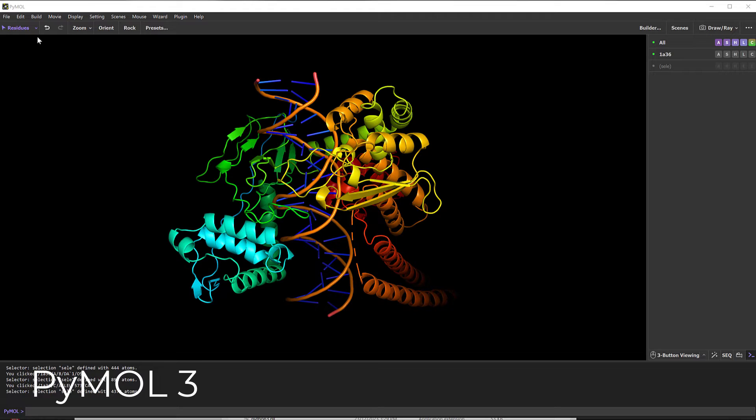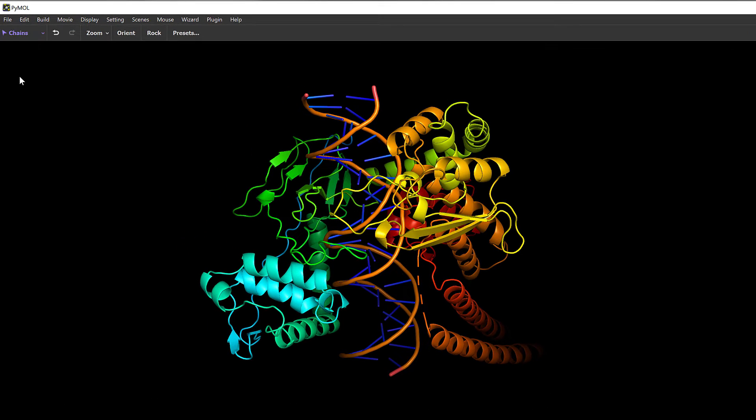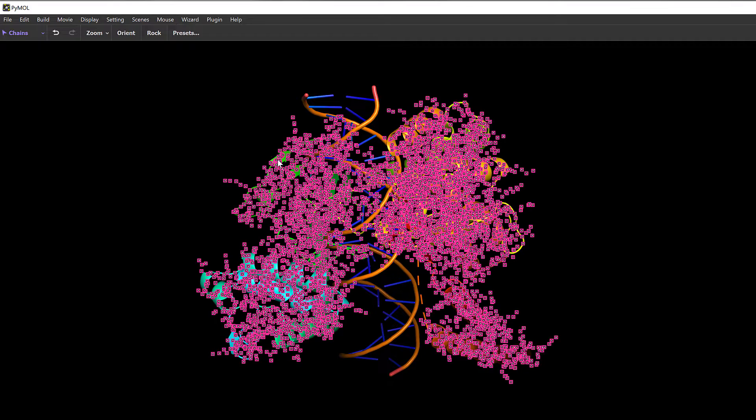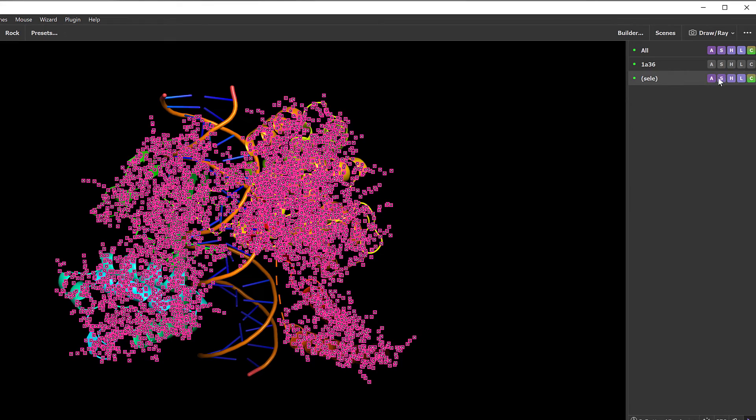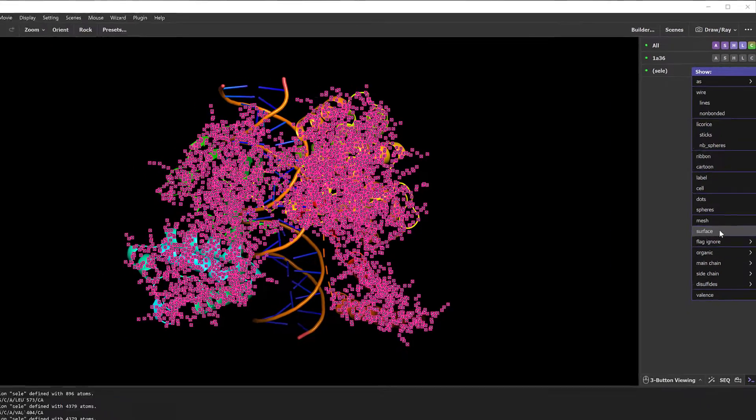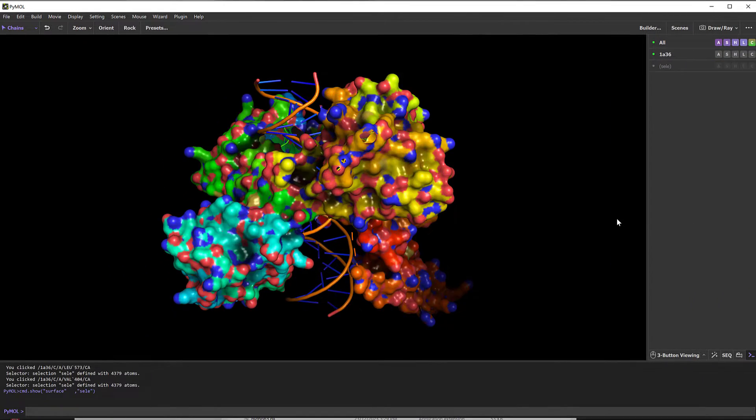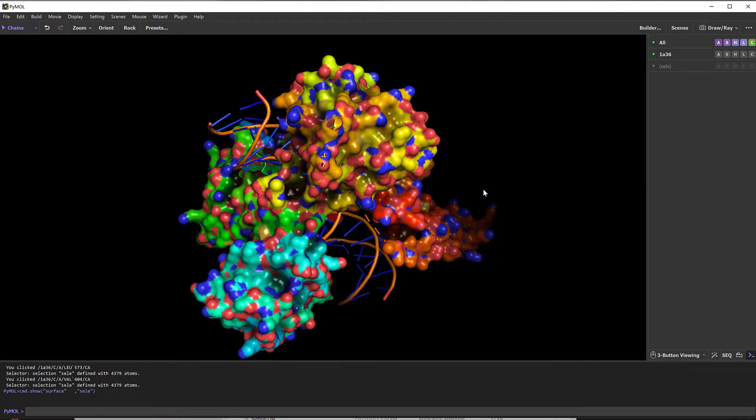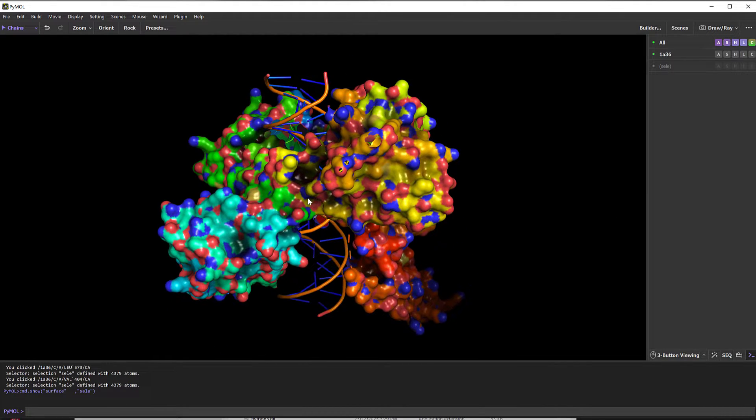And finally, let's offer a glimpse into the upcoming new version of PyMOL. PyMOL 3 is set to bring a new sleek and minimalist interface, balancing freshness and innovation while still evoking a sense of familiarity and nostalgia with the older versions of PyMOL.